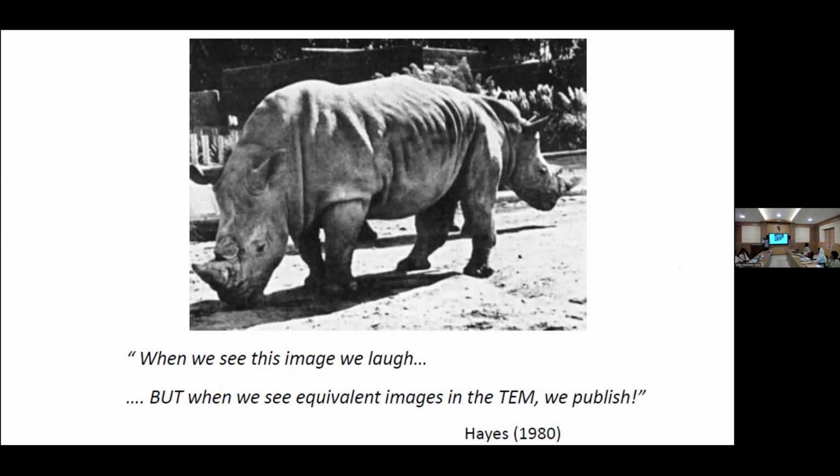So that's why this is important. Here they say, like in real life we laugh, and if you see in this research, we will publish something like that. So the meaning is that you should be very careful about inputting or analyzing your electron microscopic sample, because it's a projection image. So there maybe errors may happen.